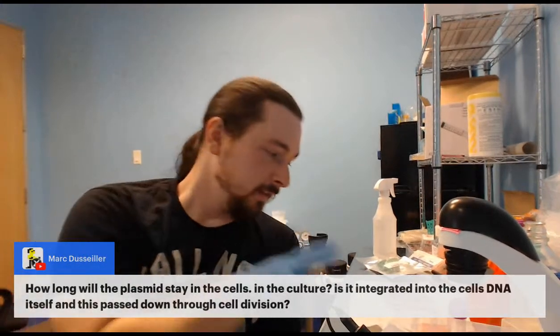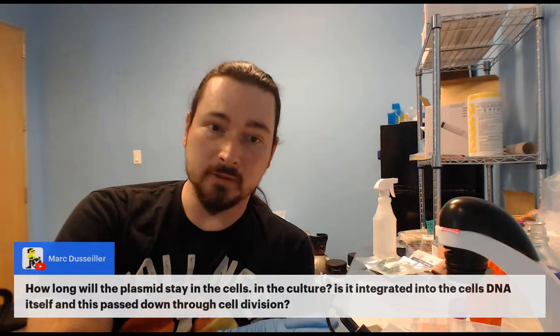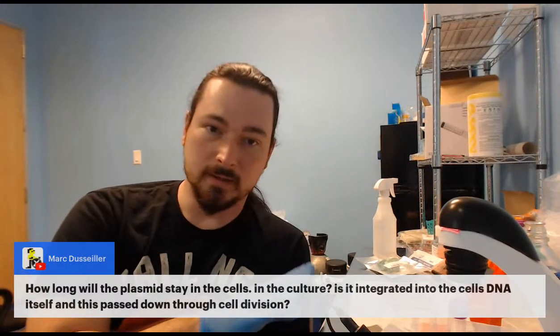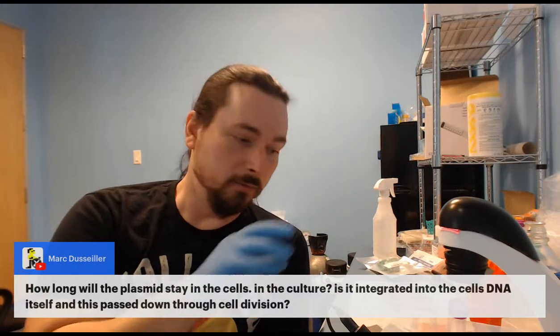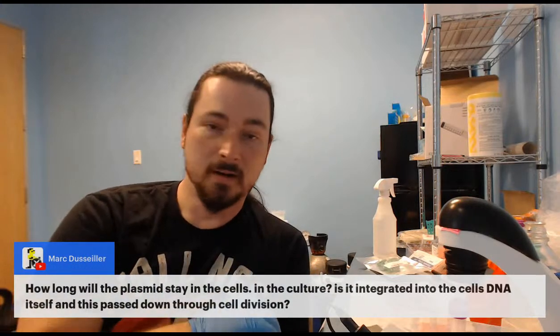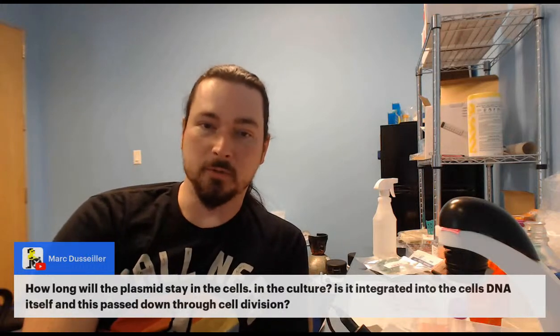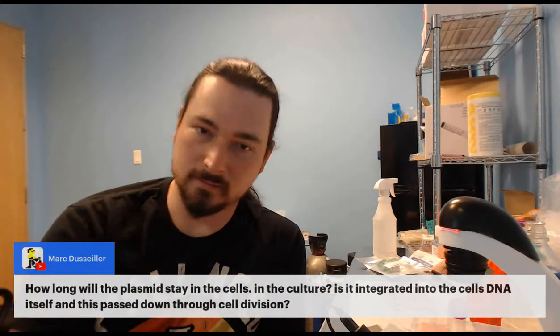But generally, this is a transient transfection. If you just stopped using G418 and just grew them, put them in a flask, kept growing them, it would be gone after a while, and you would add more X-gal later on, and nothing would happen.